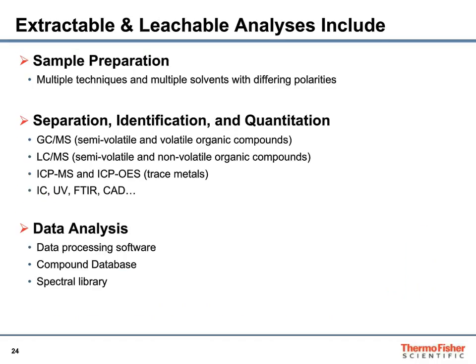Extractable and leachable analysis includes sample preparation. There are multiple techniques and multiple solvents required. And then you need to do separation, identification, and quantitation, because there are varieties of compounds involved. Therefore, GC-MS, LC-MS, ICP-MS, and other instruments like ion exchange chromatography, UV, FTIR, and CAD, which is charged aerosol detector, are required.